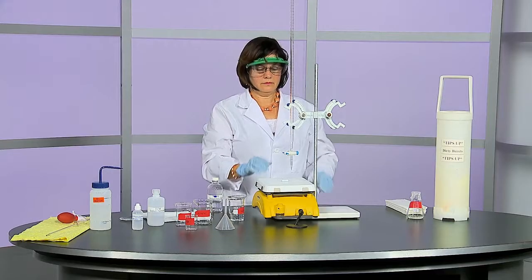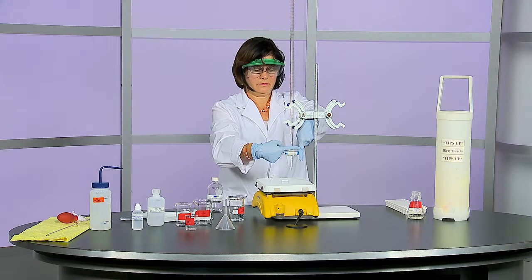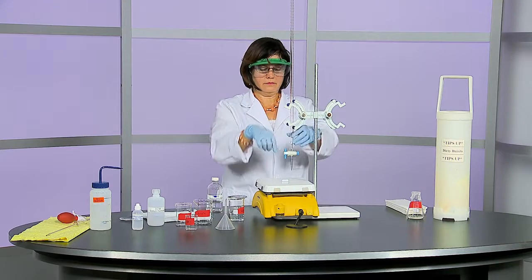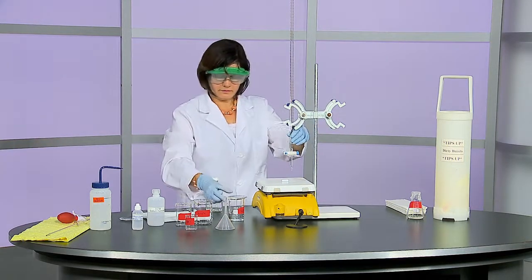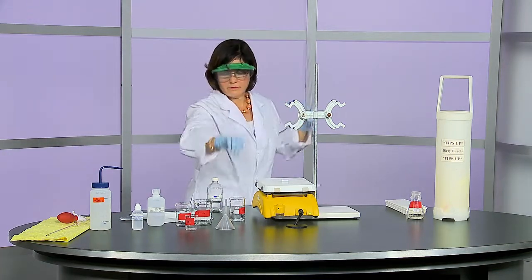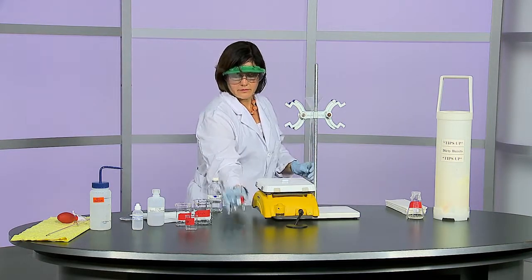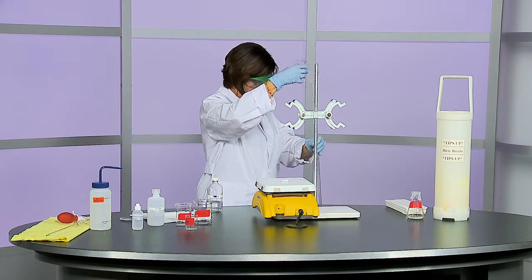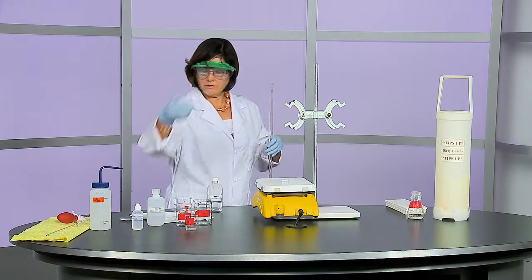The valve on the burette is closed when it is perpendicular to the body of the burette and open when it is parallel to the body. Now let's condition the burette with sodium hydroxide. First, double check that the valve is closed. Place the funnel on top of the burette and pour a few milliliters of sodium hydroxide into it. Remove the funnel. Don't place it directly on the bench top.